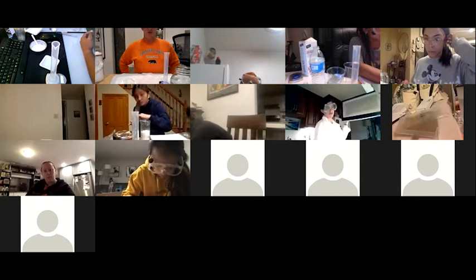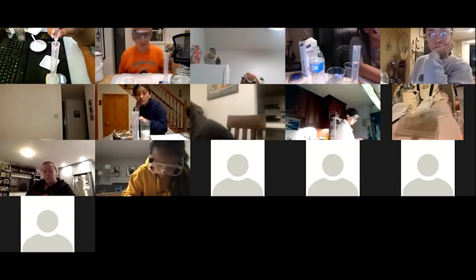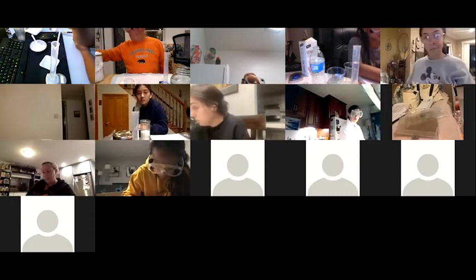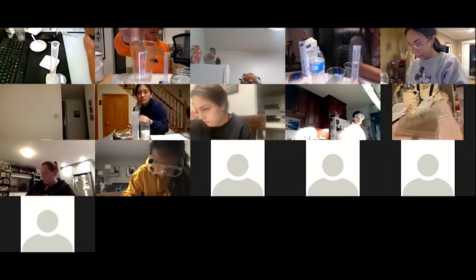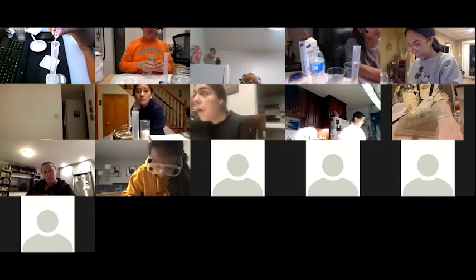Graduated cylinder doesn't measure mass, it measures volume. So put 50 mils in the graduated cylinder and then take your empty cup. Pour the 50 mils of water in there and then weigh it.